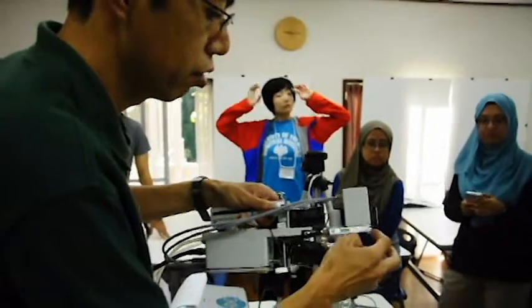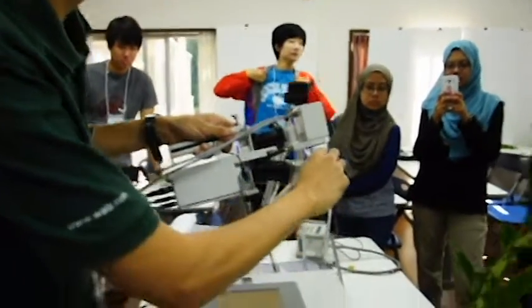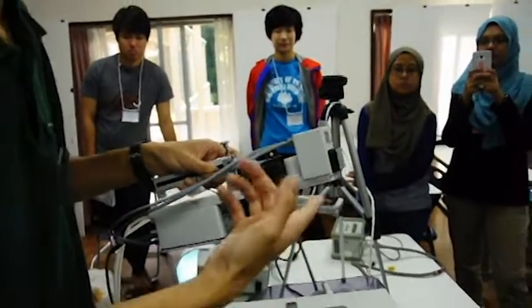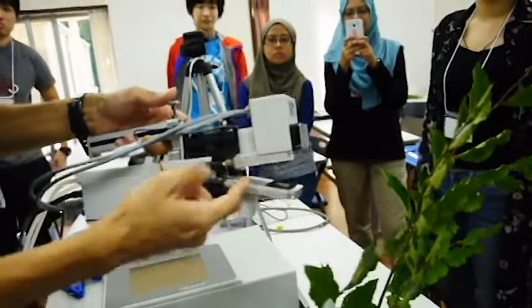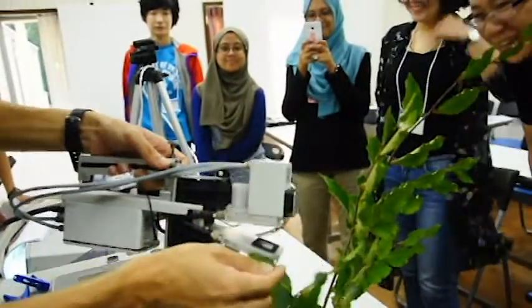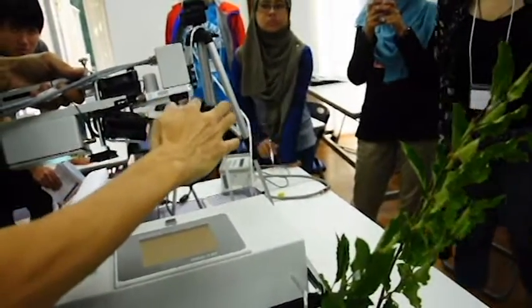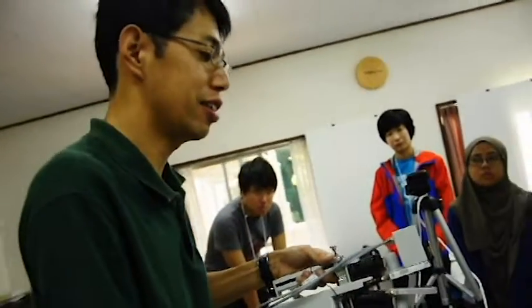Open the cuvette, and there is a very tiny wire, and this is a thermocouple to measure the leaf temperature. So when you insert the leaf, please be careful not to cut this sensor, okay? But this is also very expensive. And then insert the leaf. Please fill this cuvette area with the leaf. Do not leave empty space, because gas exchange is measured on a leaf area basis. So this system uses this cuvette area, okay?